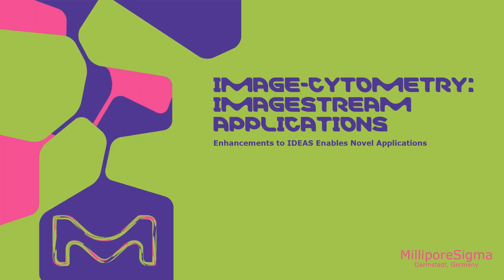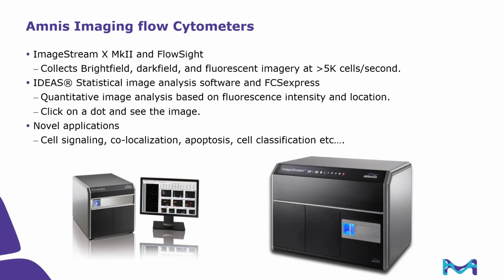Okay, great. And thank you for the introduction there, Sean. Now, my objective today in this webinar is to go through some of the basics of the Amnis technology. I understand there are a lot of FCS Express customers out there, so I'd like to introduce you to what image flow cytometry is and why we consider it a critical field in cell measurement and cytometry.